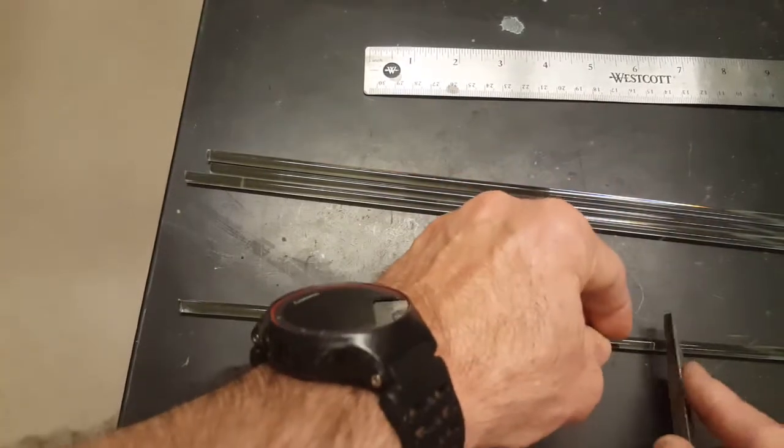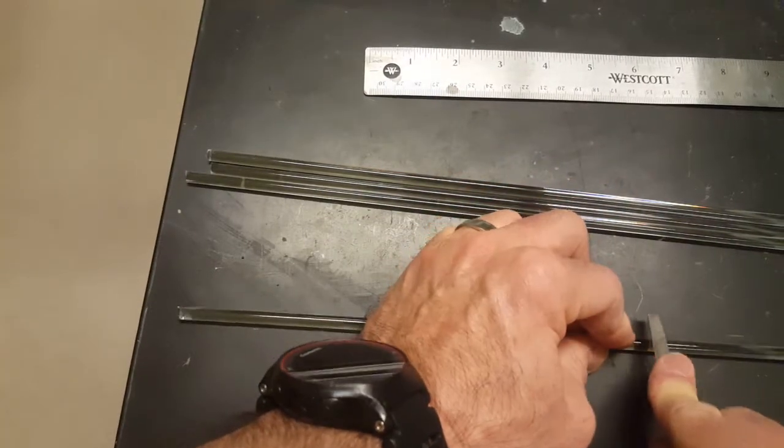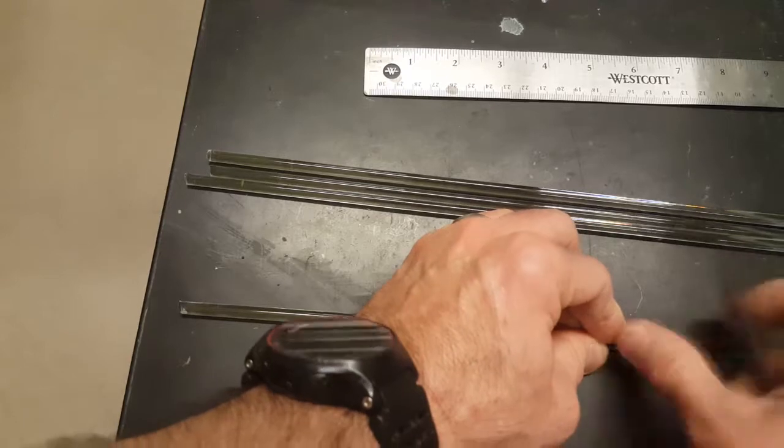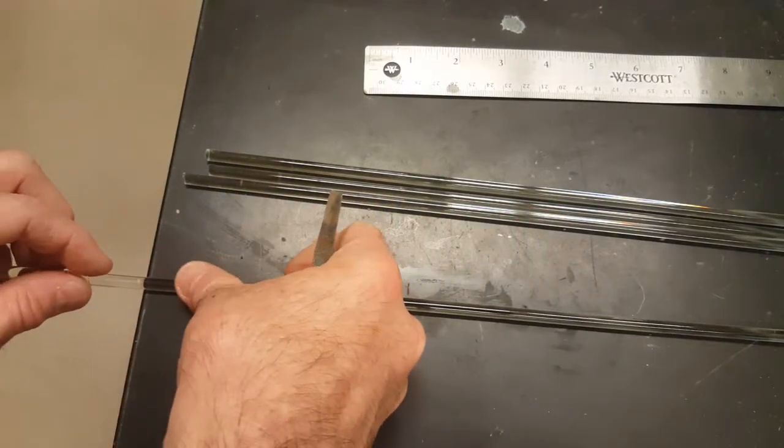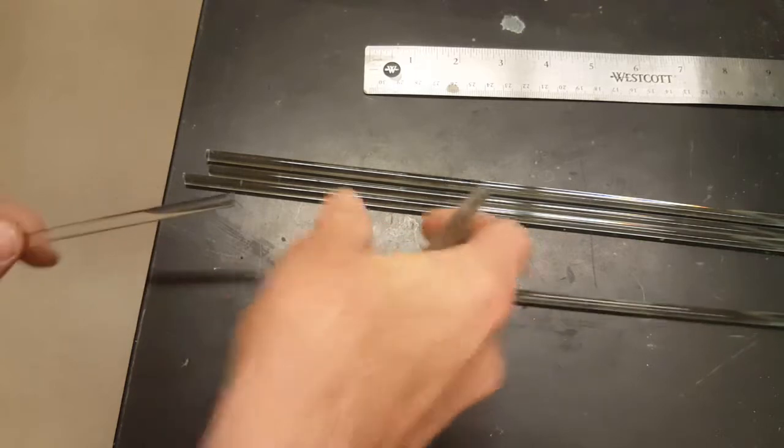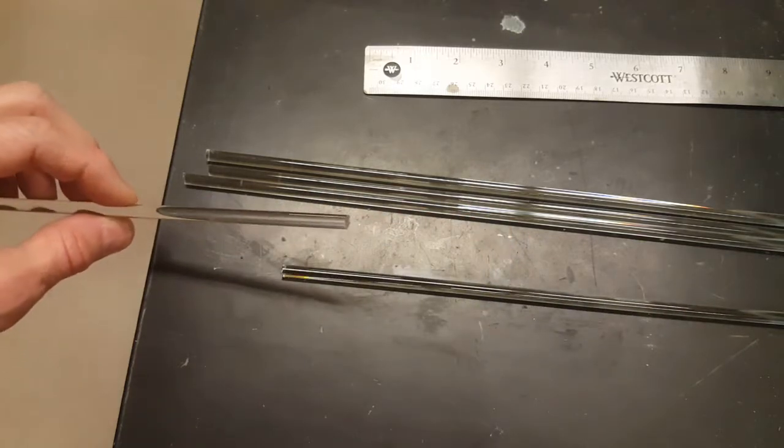When you've got the groove about halfway around, you can move that to the end of your table, and it should really easily break.